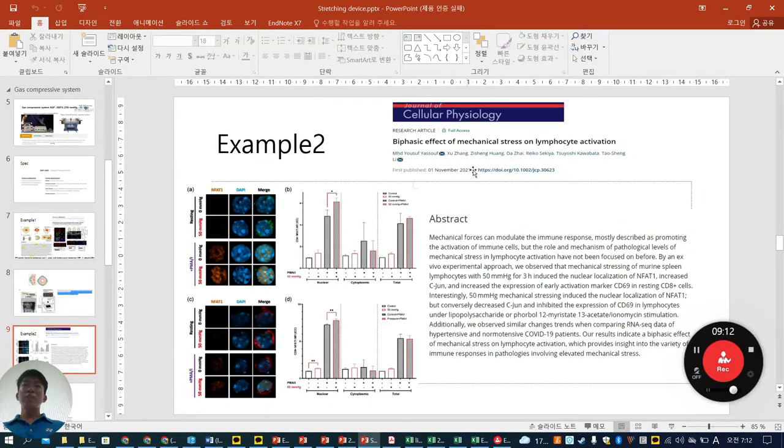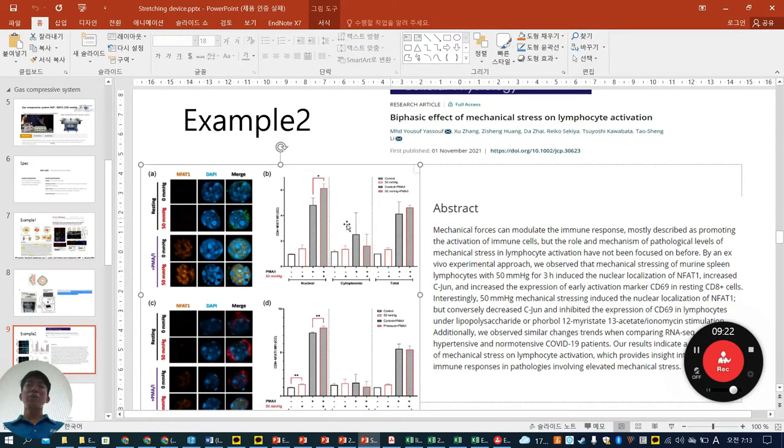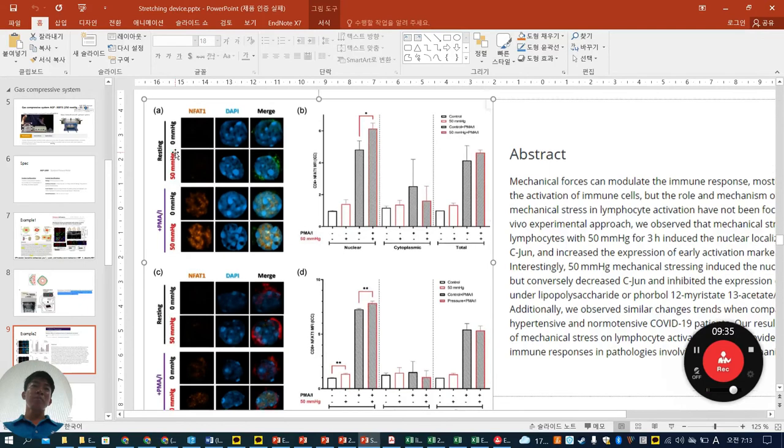And then another example is recently published in Journal of Cellular Physiology. So here, they are using lymphocyte. So they want to know the external force, like pressure, can upregulate the lymphocyte reaction. So they mentioned that this 50 millimeter mercury pressure, this is our system. So resting without activation, lymphocyte little bit activated, but under this PMA and I, this is activator of the lymphocyte, without pressure, with pressure, more highly reactive.